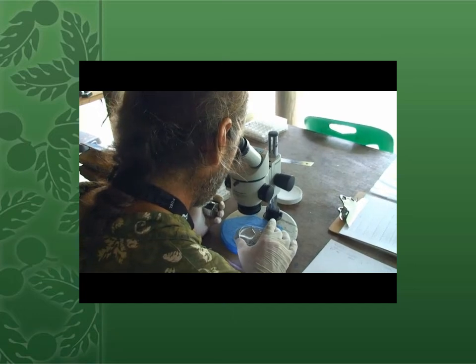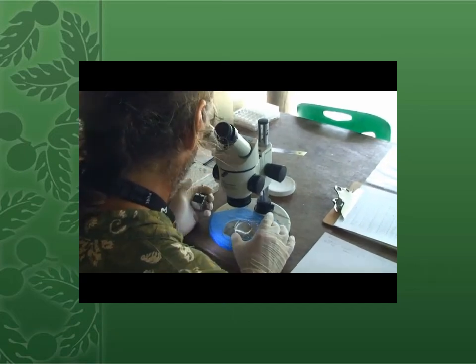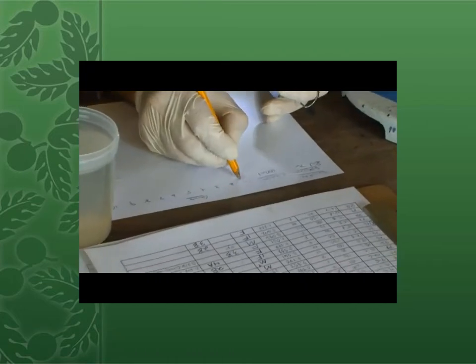Next, you'll count those eggs and record the number of eggs. You'll do that 10 times.